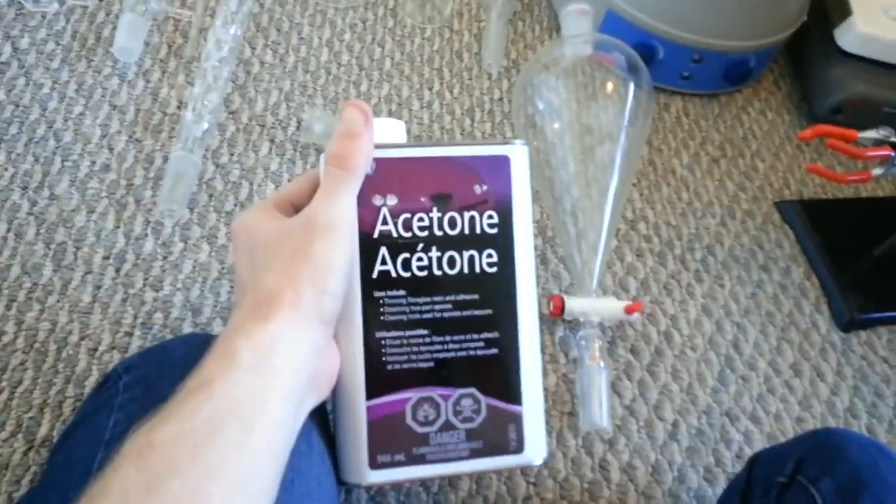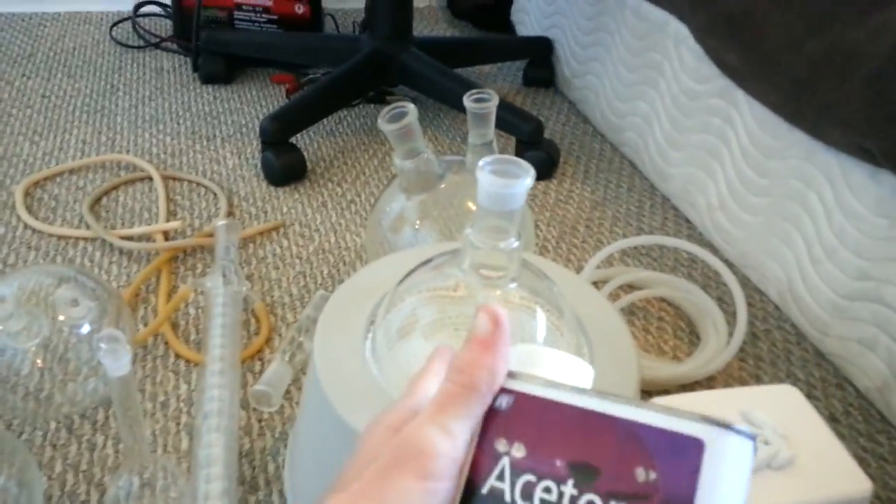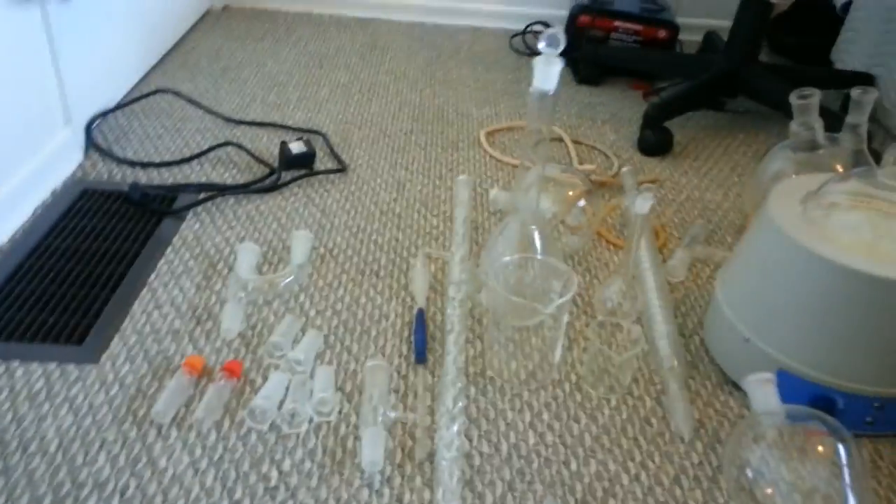Acetone: go to Home Depot or any hardware store and you can get acetone. It is indispensable for cleaning the grease off of the glass joints and for cleaning stuff out of the inside of the round bottom flasks. This was about $9 and should last me a while. Get that — it's good to have.